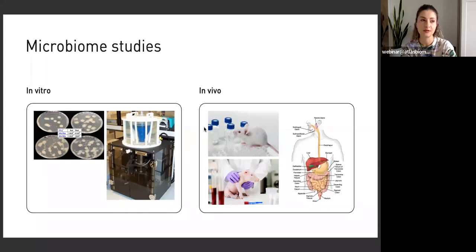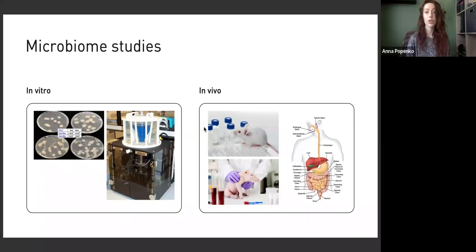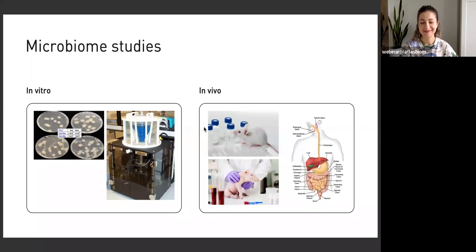Interesting. Cool. So is it true that whole genome sequencing is maybe the next solution to test other microbes? Yeah, sure. Until recently it was quite an expensive thing, the truly metagenomic sequencing, but it's getting cheaper and cheaper. So sooner or later, we will come up with this technology. Very cool. Very exciting times ahead. And also, if we use whole genome sequencing versus the 16S amplicon, is whole genome more precise in detecting even the bacterial genome, or is it as precise as 16S?